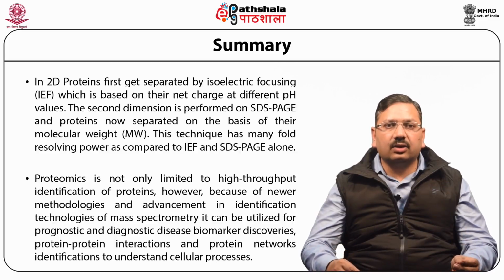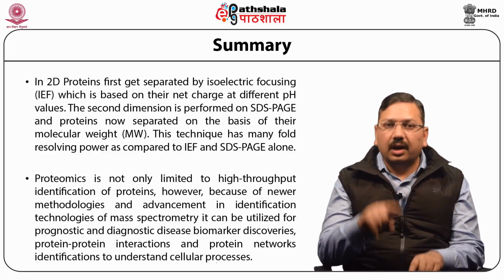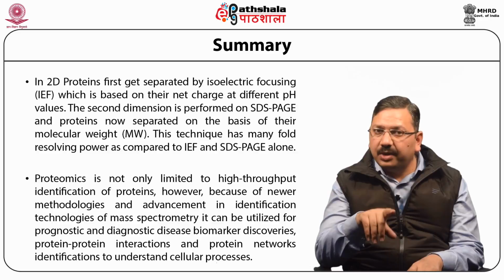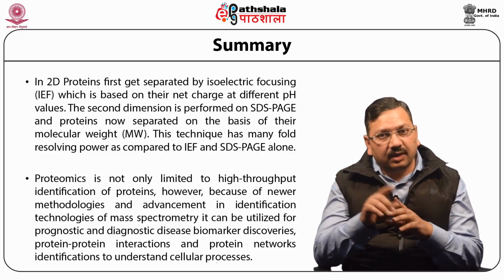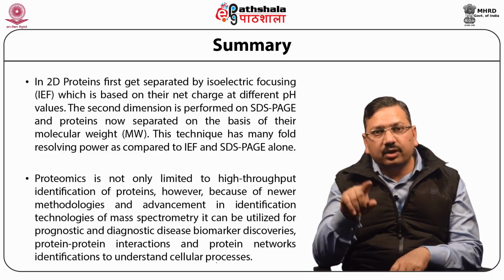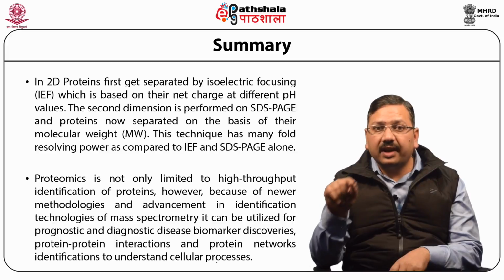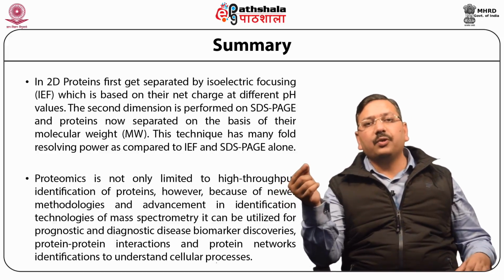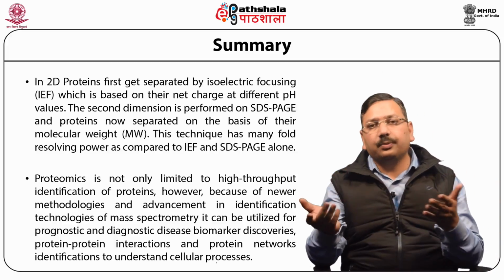In 2D gel electrophoresis, proteins are first separated by isoelectric focusing, which is based on net charges at different pH values. The second dimension is performed on SDS-PAGE, and the proteins are now separated on the basis of their molecular weight. This technique has manifold resolving power as compared to isoelectric focusing or SDS-PAGE alone.